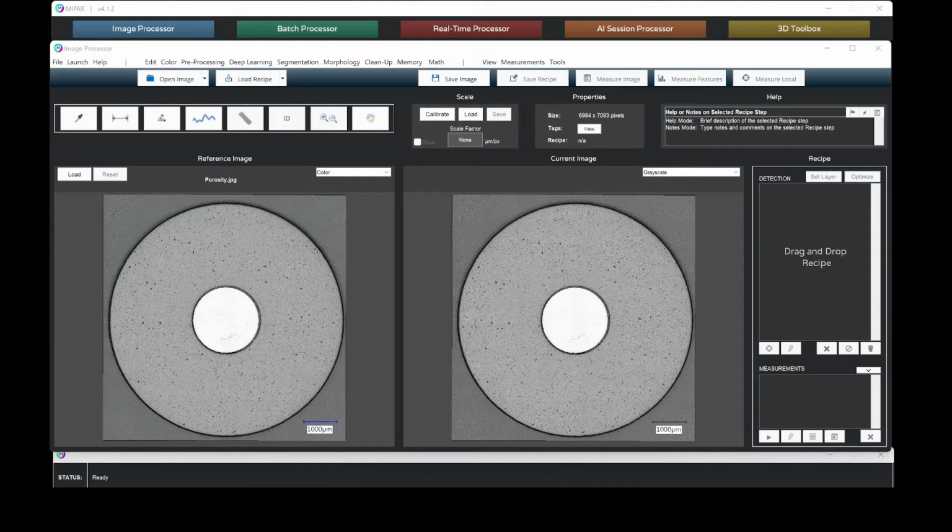In the past, this analysis would be done manually or using mercury intrusion methods. During the manual process, an operator would annotate the image with the pores and then subclassify the pores based on their size, which was extremely time-consuming, especially for larger sample sets. The mercury intrusion method was also quite challenging for this analysis that required a closed porosity measurement.